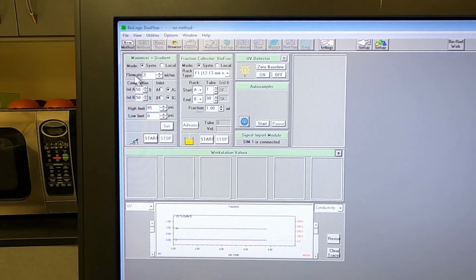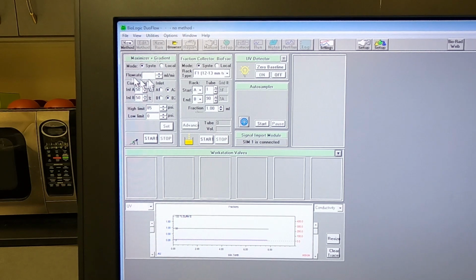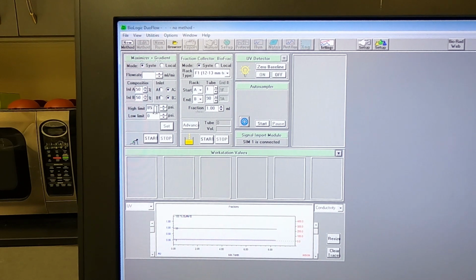So in system mode, you'll see that it's now accessible. But you can find set options like flow rate in milliliters per minute. So the flow rate specifications are given to you with the column instructions. So if you look up the specs on the spec sheet, it'll tell you what the maximum flow rate will be. And down here, it's also going to tell you in the spec sheet what the maximum allowed pressure for the column is. So in this case, we have a 1 milliliter column, which has a max pressure of 45 psi. But the reason it says 85 psi on the software as our maximum is because we have a back pressure regulator located just after our pumps and the flow path. So that adds an additional 40 psi. So together that gives us a nominal max pressure of 85 psi here.